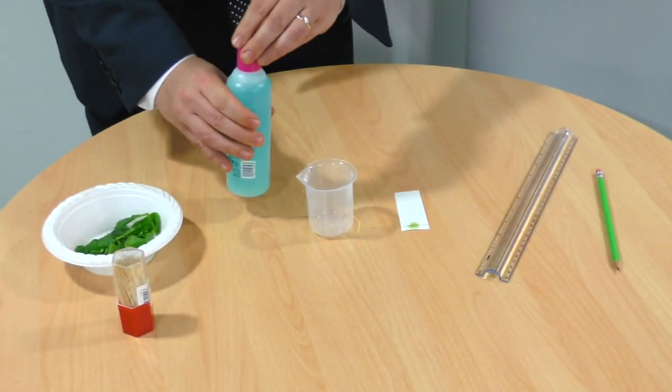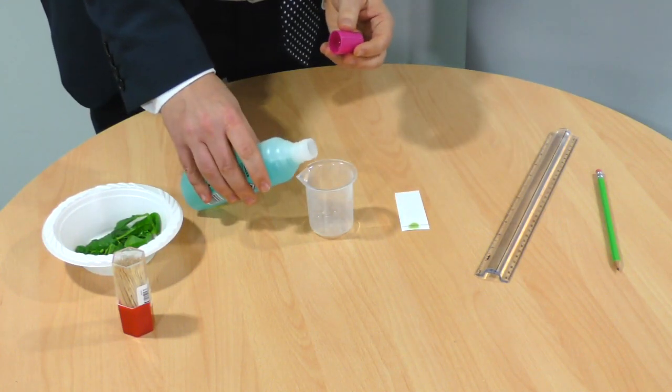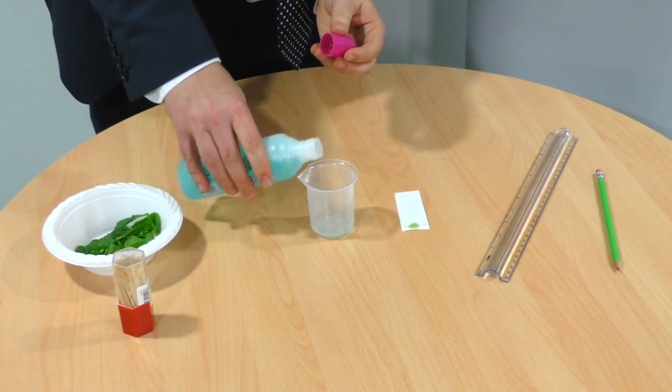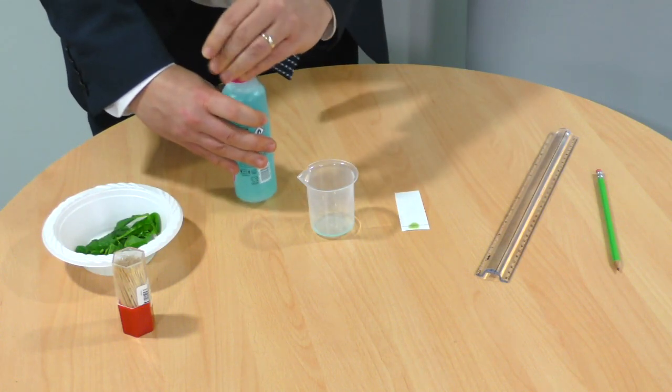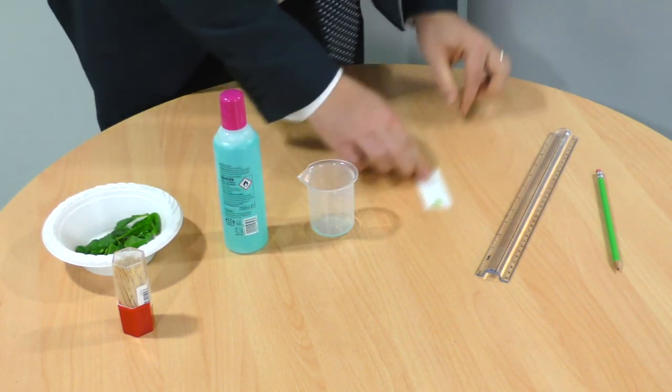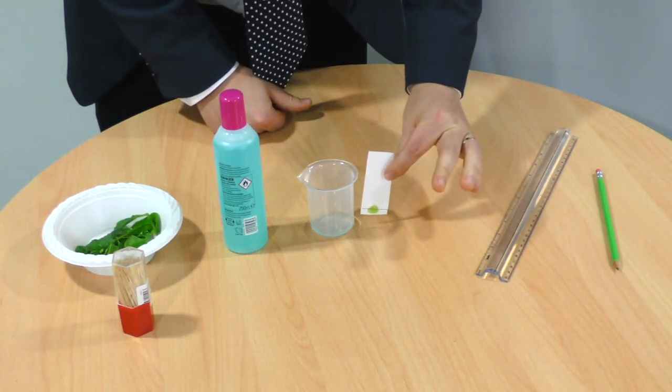For the next stage, carefully pour a small amount of your nail polish remover into a beaker. Then we're going to suspend our filter paper so that it just touches the solvent at the bottom.